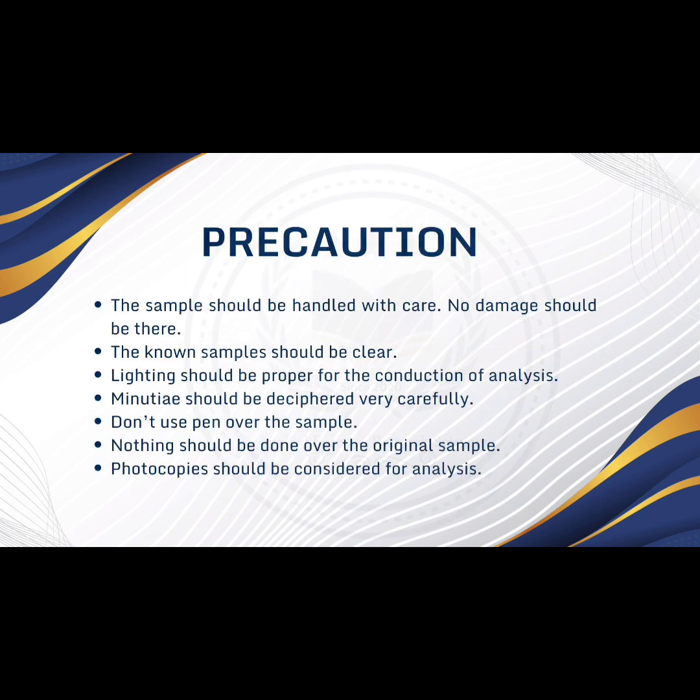During the analysis process, there are certain precautions that need to be taken care of. First, no damage should be done to the sample, as the questioned sample should be handled very carefully. The known sample should be clearly taken, so that matching with the questioned sample is easy, precise, and perfect. Then the lighting should be proper for the analysis. The minutiae should be deciphered very carefully, and each characteristic should be marked properly.